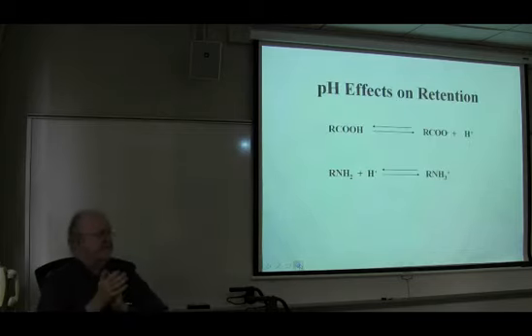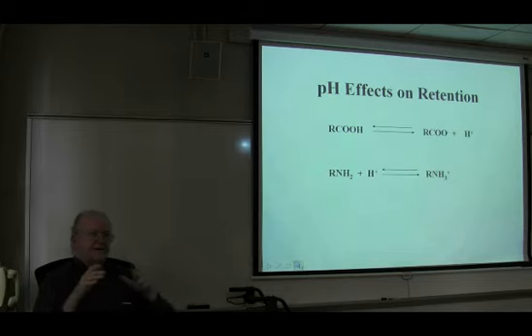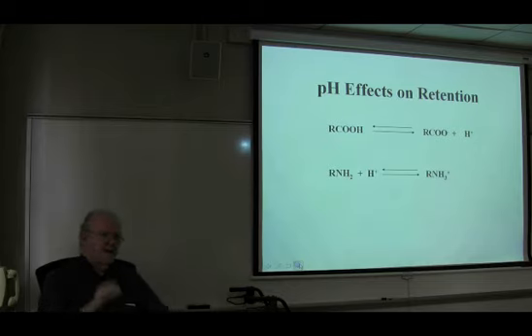All right. Changing gears enormously, we're going to talk about the effect of pH on retention. Neutral compounds, compounds that are not acidic or basic, you can change the pH and you will see essentially no change in their retention.